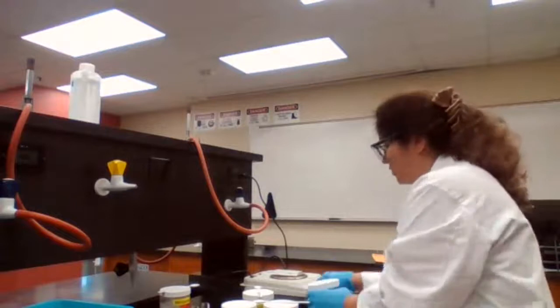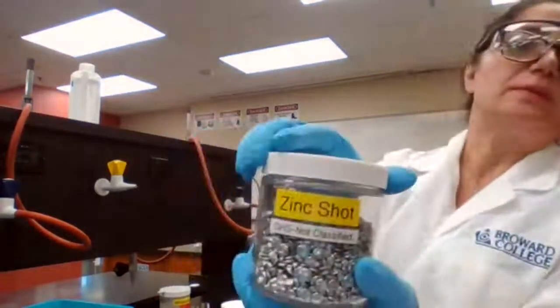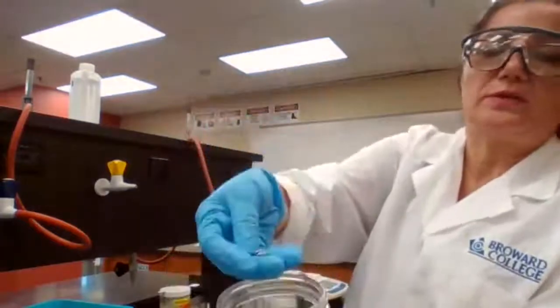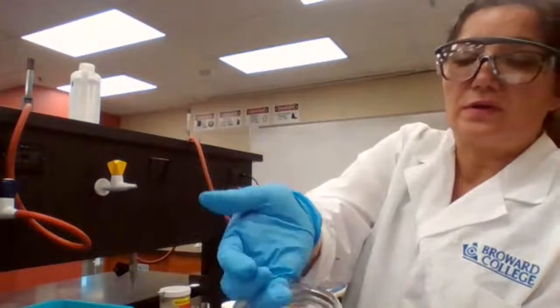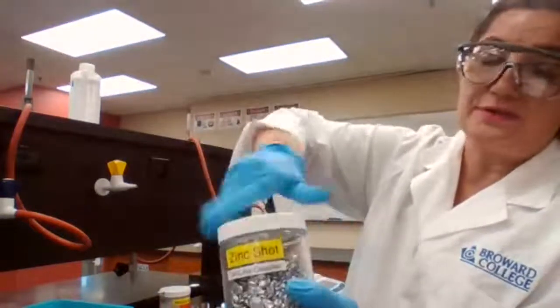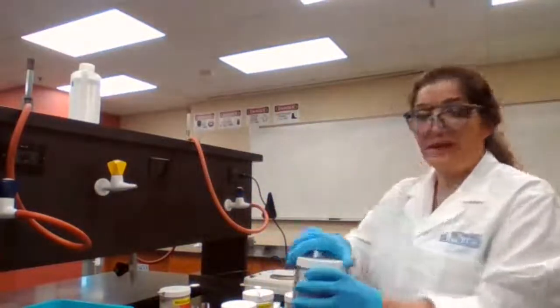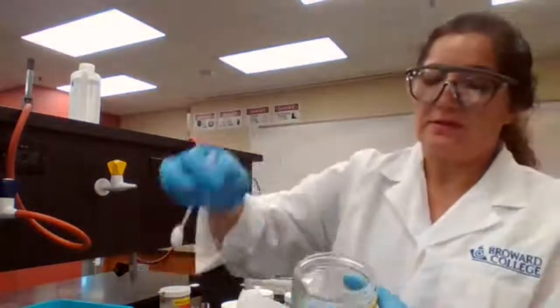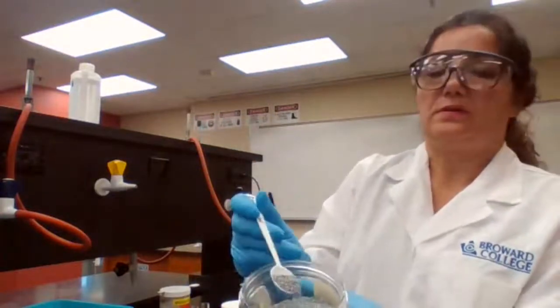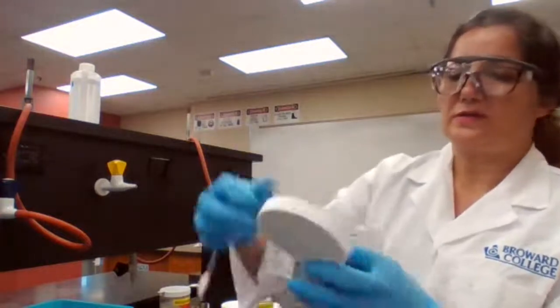So I'm just going to show you the difference. The zinc shots, larger pieces of zinc. We are going to compare the reaction for this. The larger the piece is, the smaller the surface area is going to be. And then we have the granular zinc, which is a smaller grain size of the zinc.